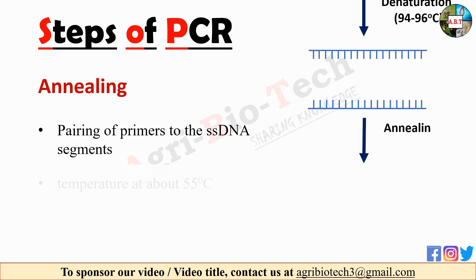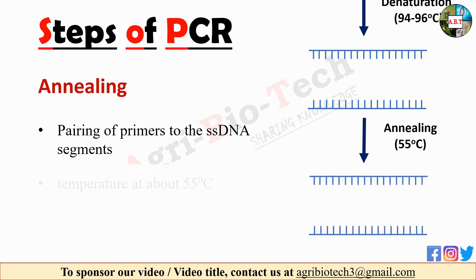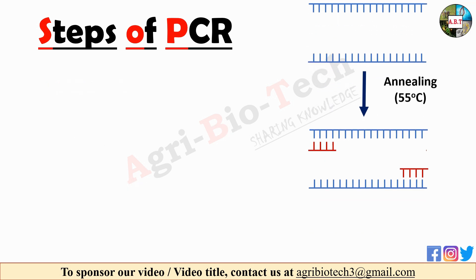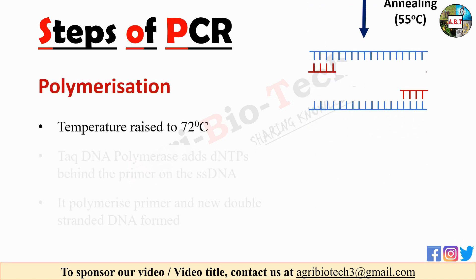The second step of PCR technique is annealing. Annealing is a step followed after denaturation. It is the pairing of primers to the ssDNA segments. The primers have to be designed as per the requirement. This step requires a temperature of about 55 degrees Celsius.